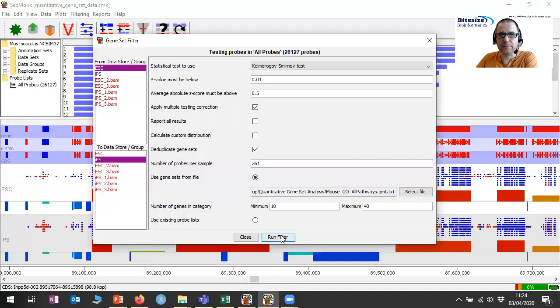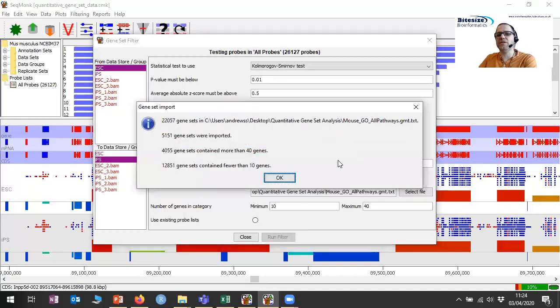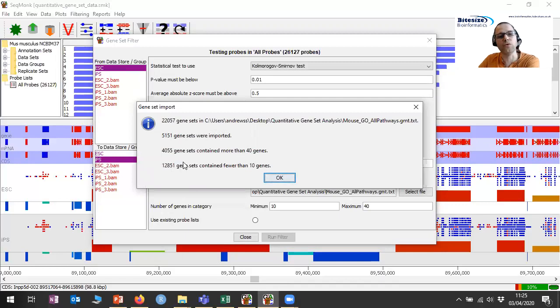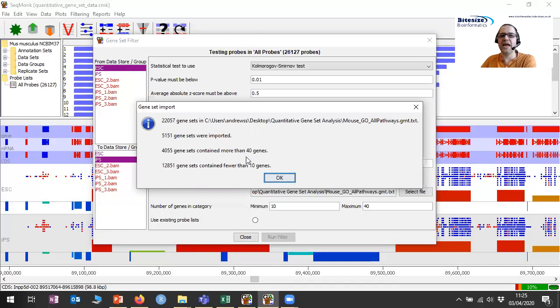So let's go and actually run this test now. The first thing we're going to see is the results of the gene list filtering. There are 22,000 gene sets in this file, but we're only going to end up testing around 5,000 of them. About 4,000 had more than 40 genes, and nearly 13,000 had fewer than 10 genes in the set. So there's an awful lot of functional sets that have really small numbers of genes. Excluding those has given us a real boost to our power to detect.